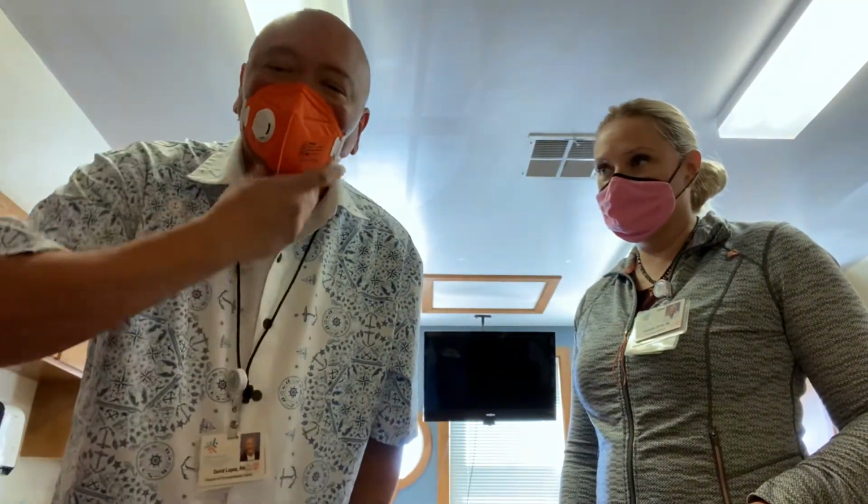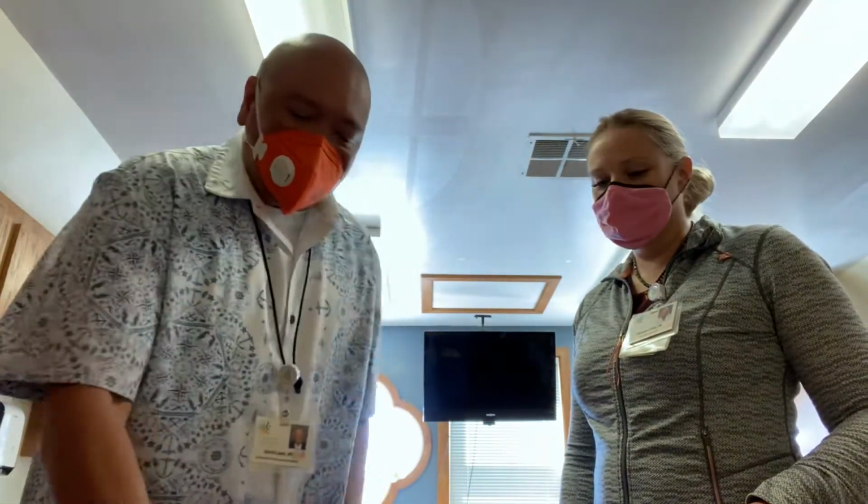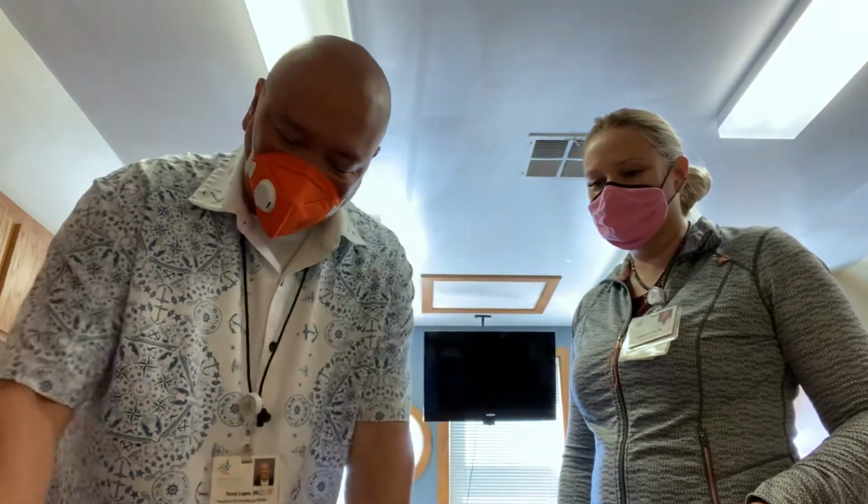Now, for some people, there will be mustaches growing. I'm sorry, but you need to make sure safety is number one. Try to trim that beard down to the point where you can fit the mask properly. Because if not, you'll have not a good seal, and then you'll risk yourself dealing with problems with COVID. Okay? The next is you'll need some hair nets, shoe covers, and your gloves.